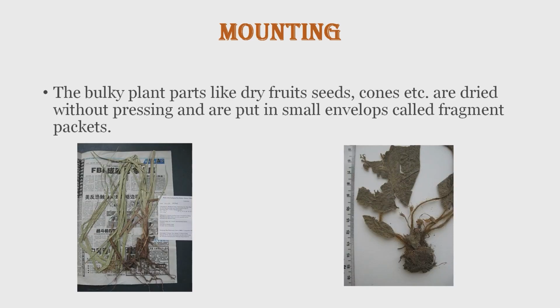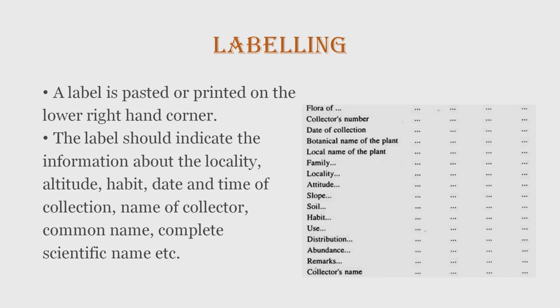In case of pressing the herbarium, we should not press the bulky plant parts like dry fruits, cones. They can be dried without pressing, and they can be put in small envelope covers called fragment packets, and they can be attached along with the herbarium sheets.